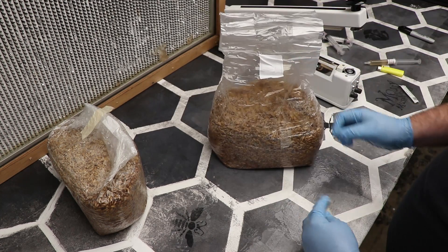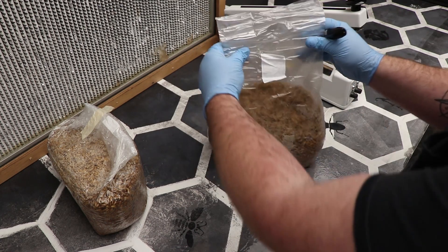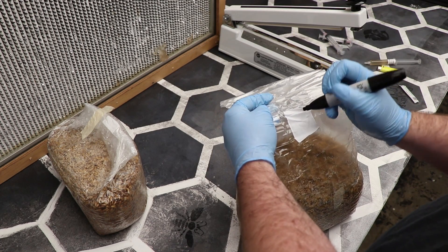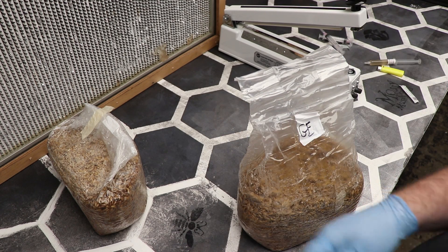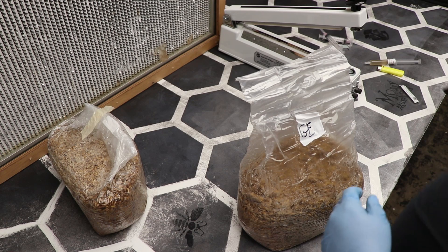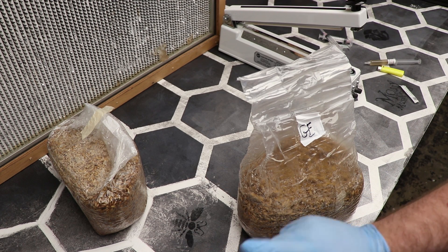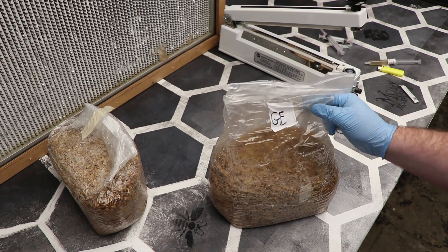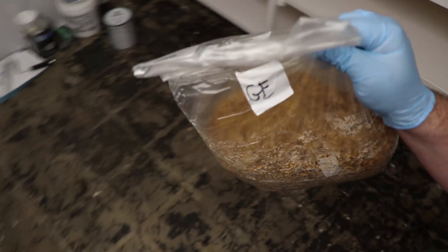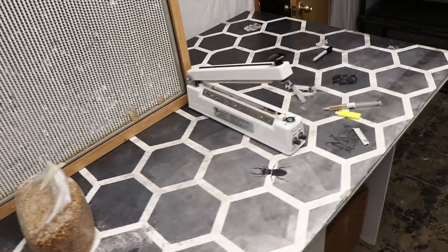Take the bag off, remove the tape, take my Sharpie, and just use my code for the bag — which for Golden Enoki is just GE. Very simple. My lab notes and my paperwork will have my date, who did the bag, and where I got the culture from. So that bag is done. I will now take it and shelve it, and on to the next one.